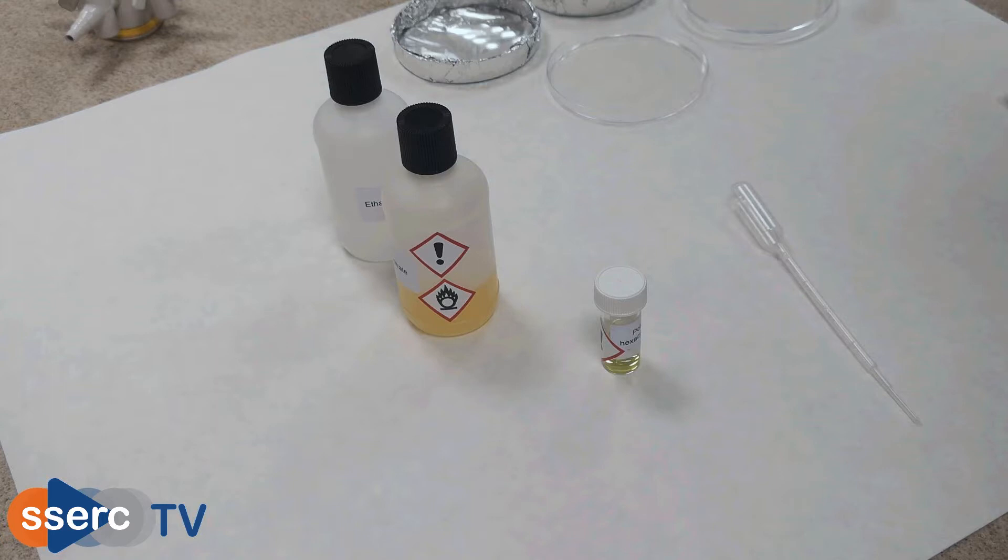Prior to where this video starts I've prepared the solutions. I added 40 milliliters of water to each of the bottles and have shaken to dissolve the iron nitrate and ethane dioic acid, and I also added two cubic centimeters of water to the potassium hexacyanoferate in the bijou and shaken to dissolve as well.